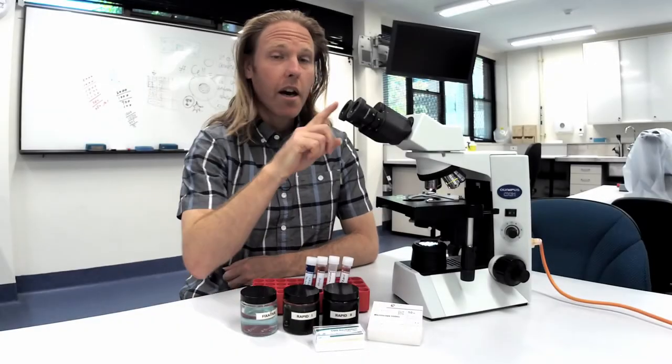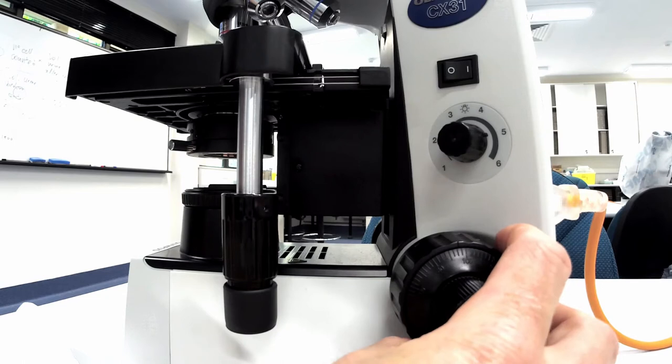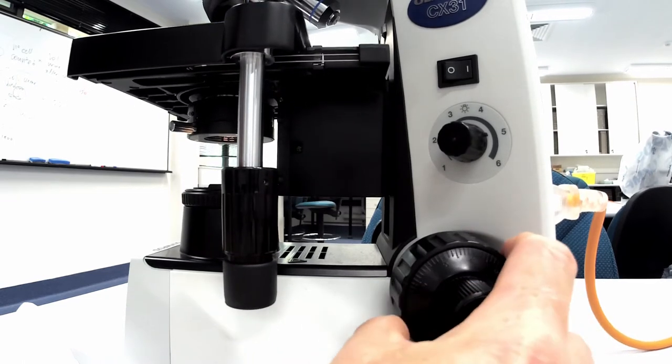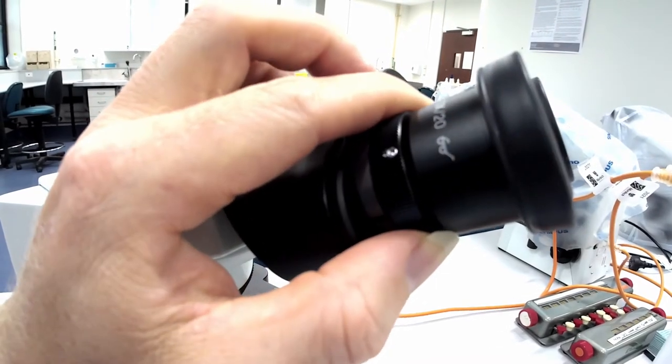Adjust the eyepieces next. One will have a ridged adjustable ring and the other will be plain. Use the coarse focus knob to bring the stage into focus looking down the non-adjustable eyepiece and then adjust the focus in the other eyepiece by turning the ridged ring.